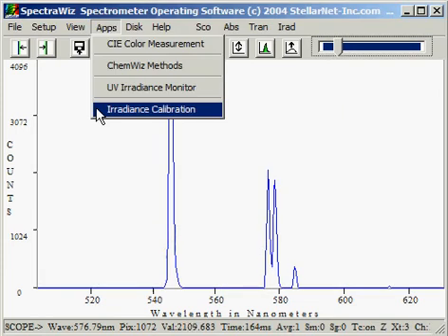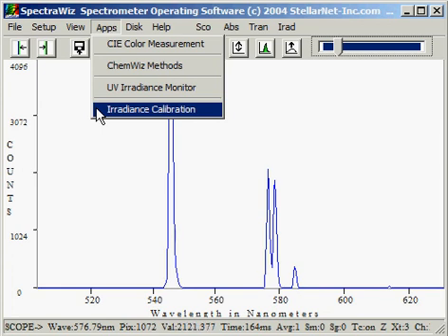Irradiance calibration allows us to set up and calibrate our instrument as a spectroradiometer if we have a calibrated halogen lamp. With just a few clicks, you will be able to measure absolute intensities, XY chromaticities, and many other parameters.